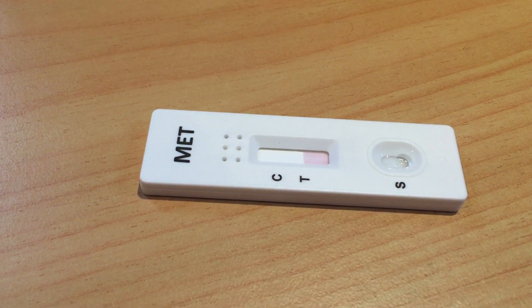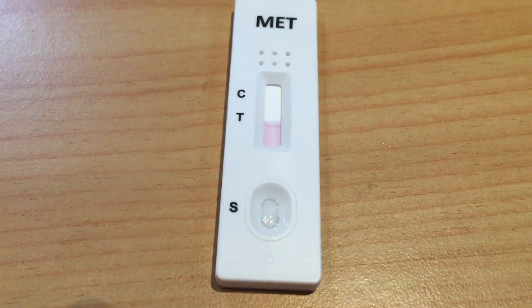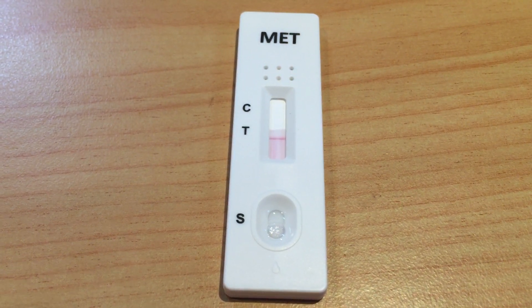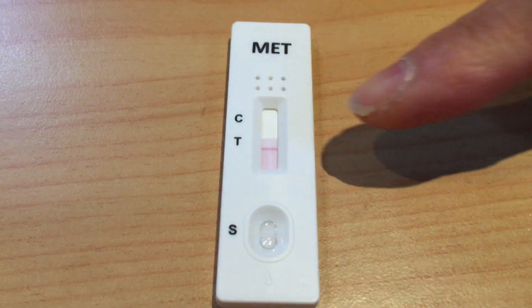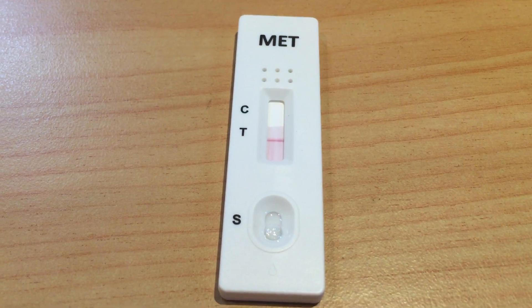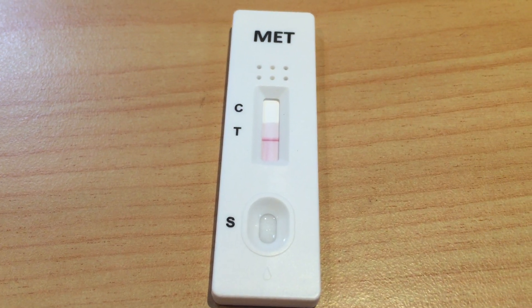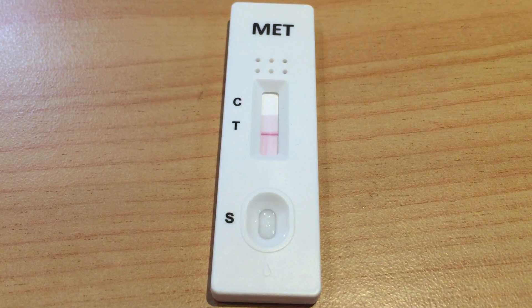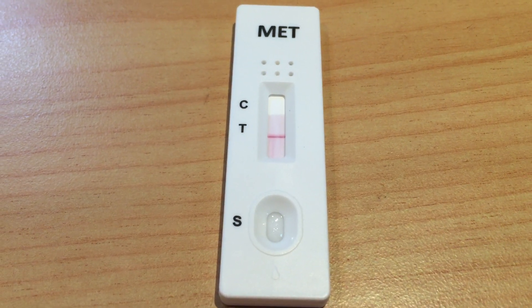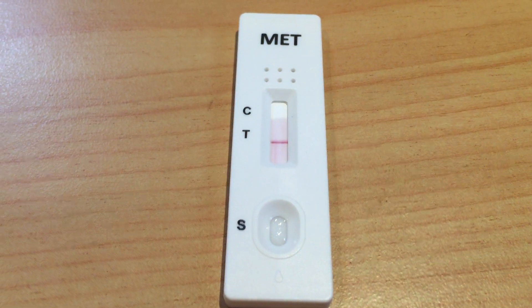So that line is getting a bit darker now. That's what it should look like if it's negative — straight away. With a positive one, it's usually quite clear, as you can see in the previous video. But on this one, the T line is getting quite dark, which proves that's how a negative result should look.